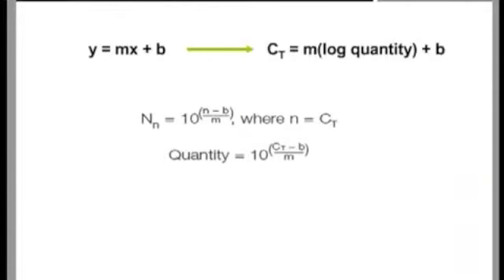In other words, whether you choose to use copies, viruses, genomes, moles, grams, or any other unit, the type of unit does not matter as long as you use the same unit for every point on the curve. When looking at different data sets, however, work with the same units for each experiment you plan to compare.